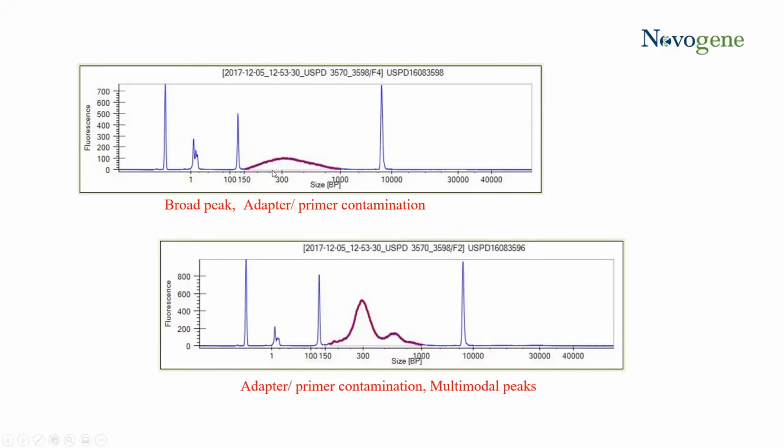At the top, we can see that this region here is adapter contamination. Adapter contamination ideally should be removed if possible. If not possible, we're generally only looking at a small fraction of data skew. You may lose a portion of the requested data to this portion here from physical interference and possible non-target incorporation. So we have some sort of adapter primer dimer contamination here.